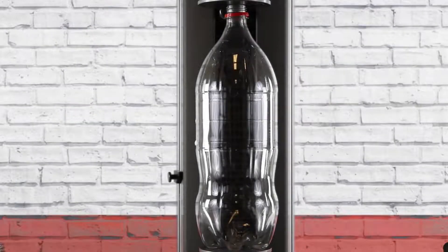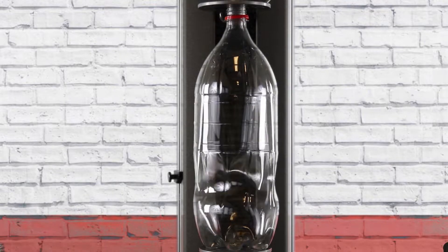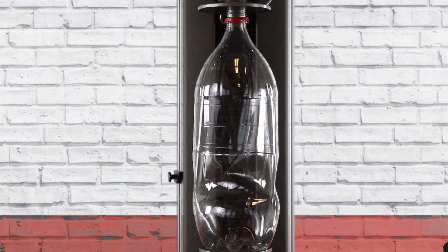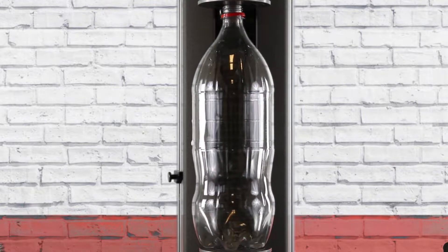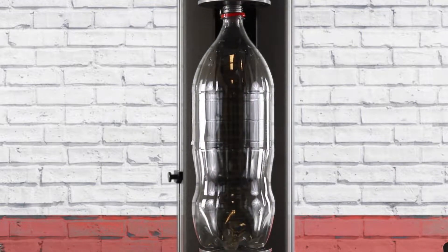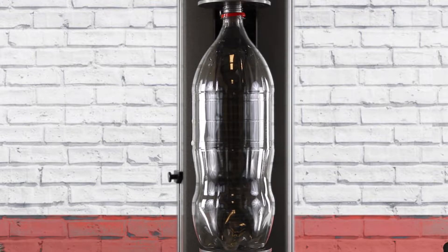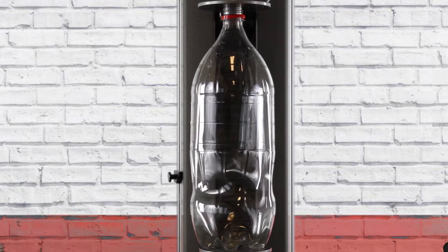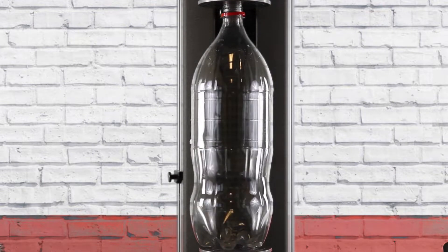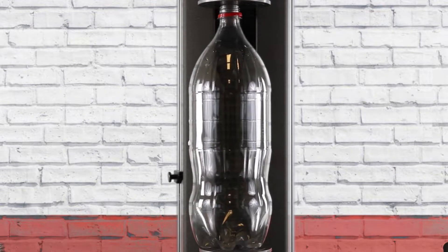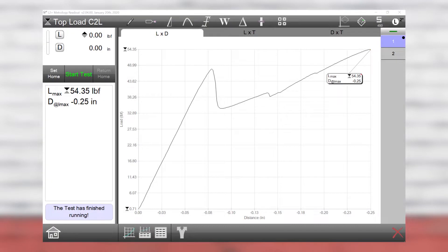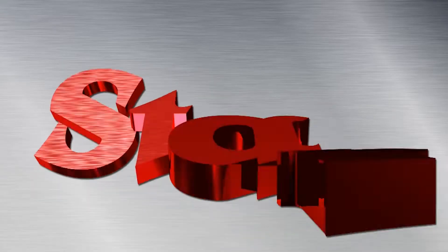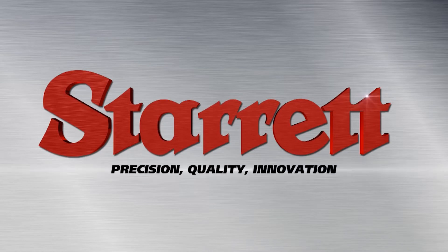So next we hit start, see it coming down, apply the load to the bottle and then return. Do it one more time, and that's finished. Thank you.